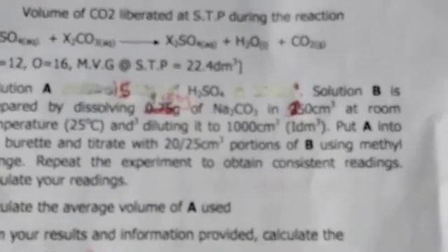So we have to correct an error here. Solution B is prepared by dissolving 1.50 gram of the carbonate in 250 cm cube. So it's 1.5 we're using, not 0.75.